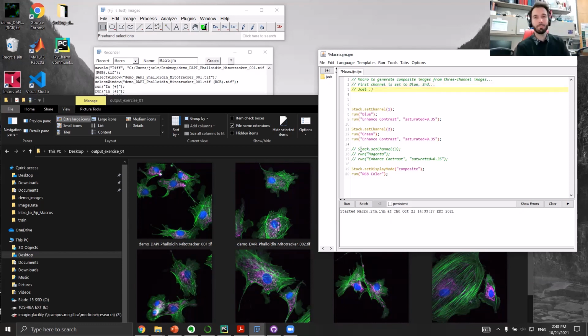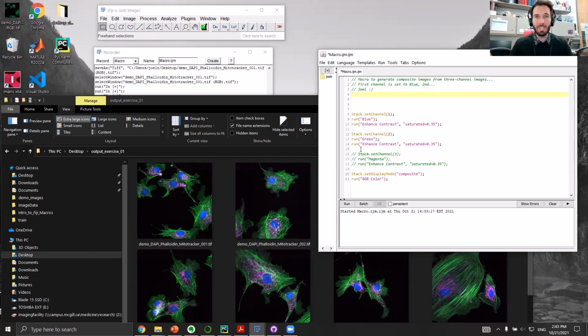Emoji too, why not? You want to be friendly with yourself when you come back in 6 months and wonder what you did. And so this is really handy because then you can also go into each kind of paragraph of code that you have and add some information such that later on it makes more sense. Again, this particular script is relatively easy to follow, but once it gets more convoluted and you have to do a little bit of pirouetting to get the values that you want, then it's helpful to add some information there.